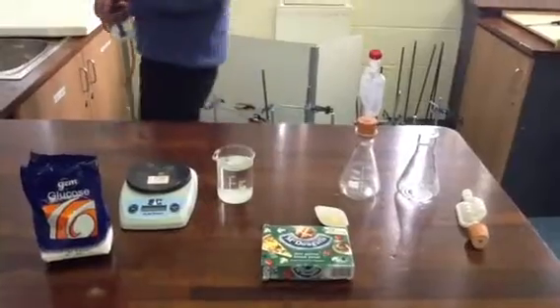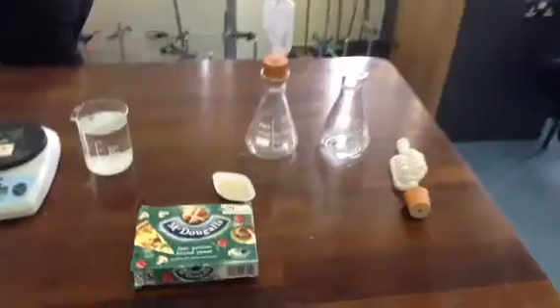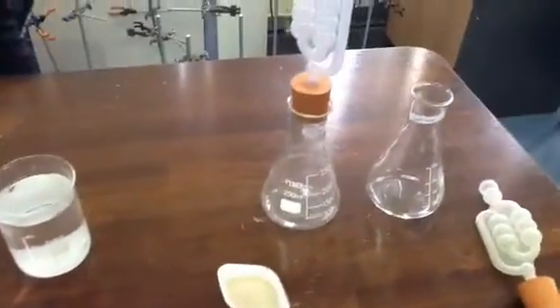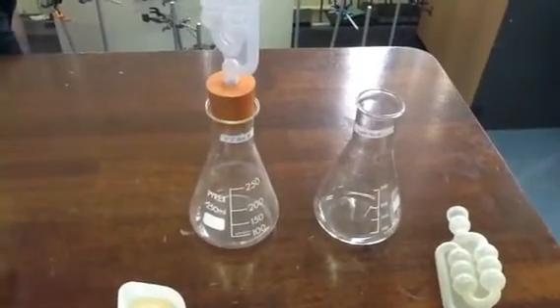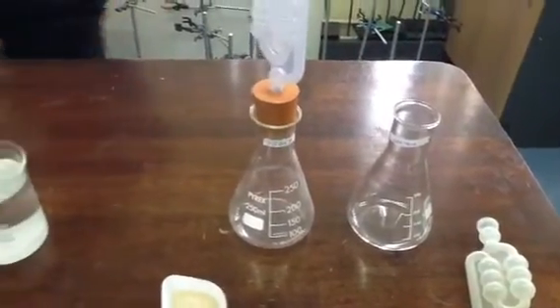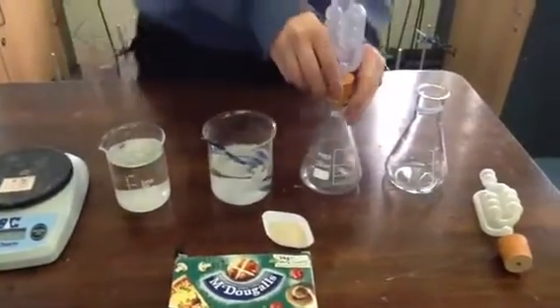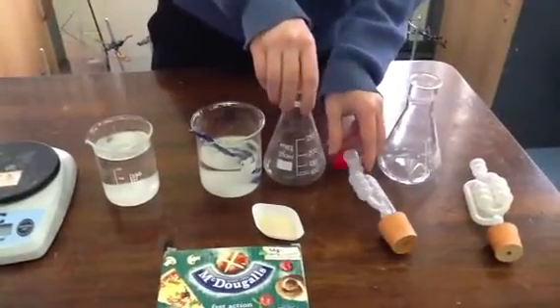Benedict, you're going to add the 250 mils of water into the flask, please. So, we have our yeast flask ready and our flask ready for our control. Now you're going to add that 10% weight per volume sugar solution into the conical flask.